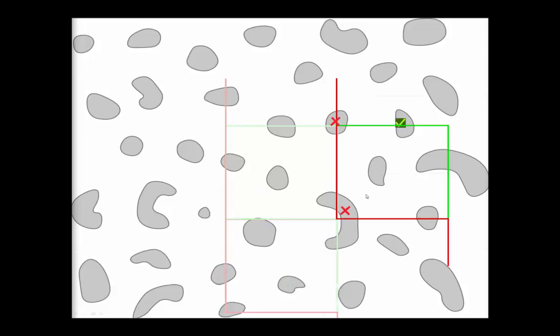So we're being very rigorous in our rules, and we're following these rules and taking a lot of pain to make sure we only count the cells that belong in this volume fraction, so that when we extrapolate out, we don't, for instance, count twice as many cells as we're supposed to.